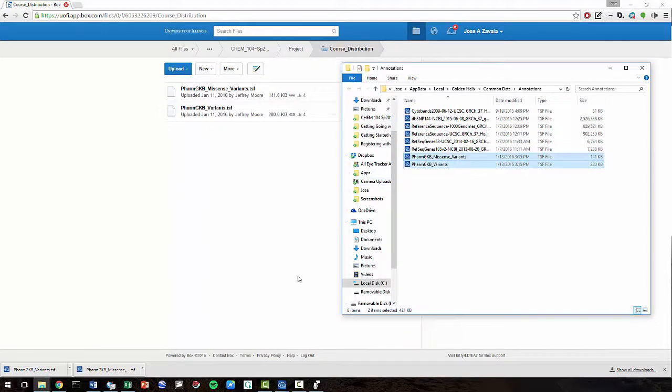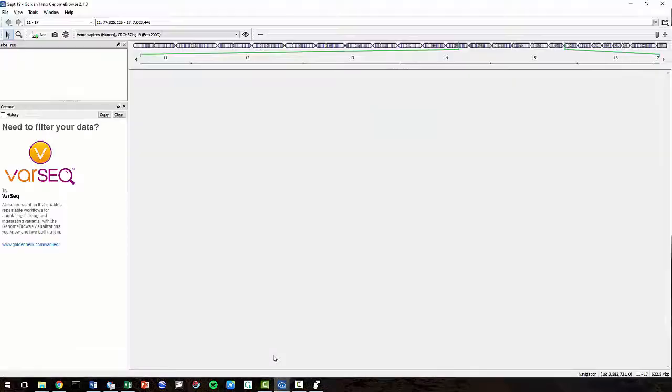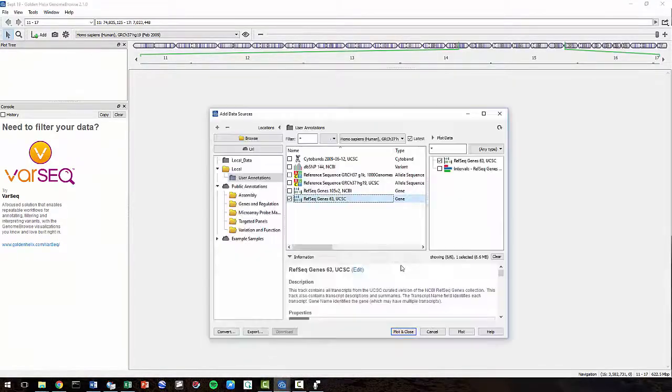Now we'll have to restart Genome Browse for it to recognize the new files.